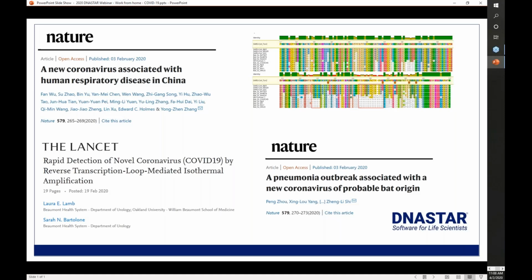So say, for example, you're doing next-gen sequencing and your 64 gig computer is in the lab and you have remote use. We do have some cloud solutions where you can turn any desktop or laptop computer into a 64 gig or 128 gig workstation to do your analyses. We also have tools for protein structure prediction, protein docking, and antibody modeling.